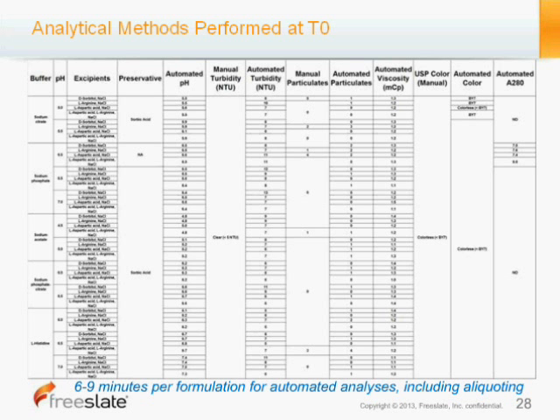other, and in addition to that, we were able to see, as I mentioned, the pH was basically on target. The protein concentration was a little bit lower than the target. However, this is just a calibrational error and can be very easily remedied. It also has to do with compounding of the two errors, error from formulation and then analytical error as well, and aliquoting error. So basically, this is just to show you how rapidly these 48 formulations can be evaluated from their 2 milliliter serum vials out to the daughter plates, and then you basically can get your information from this in about a day.